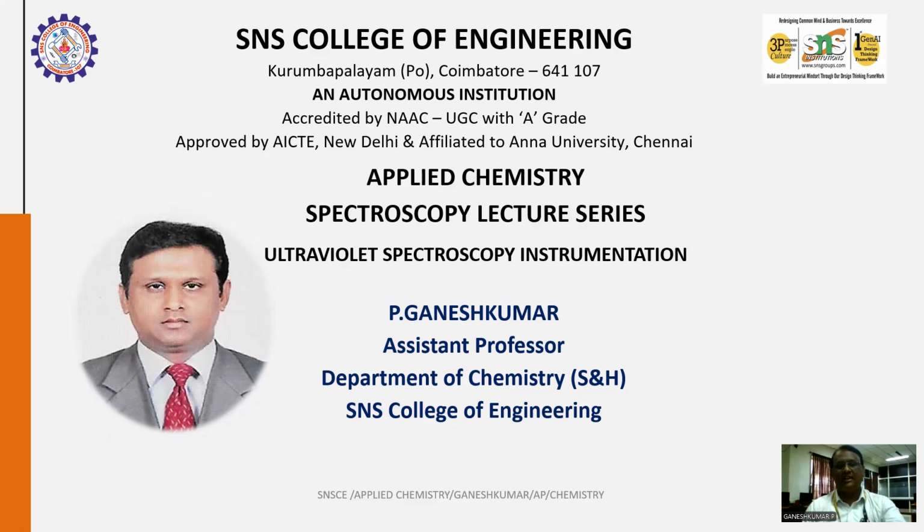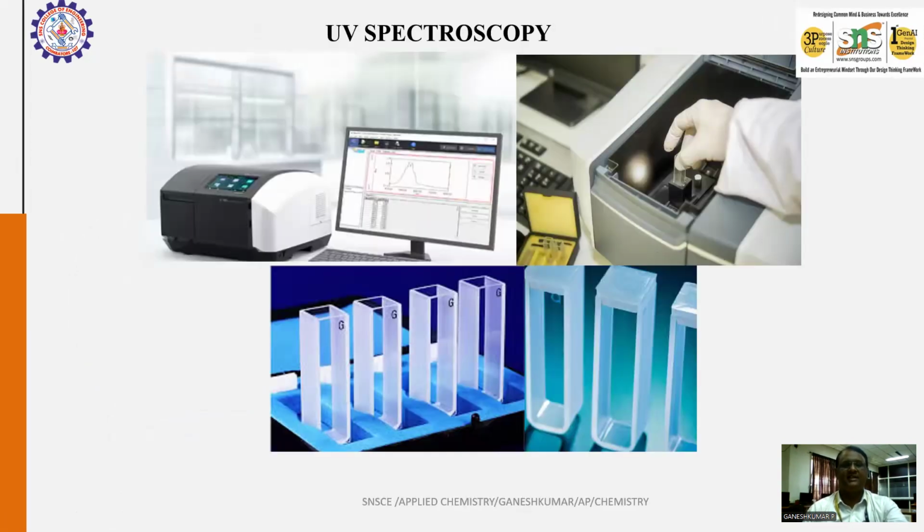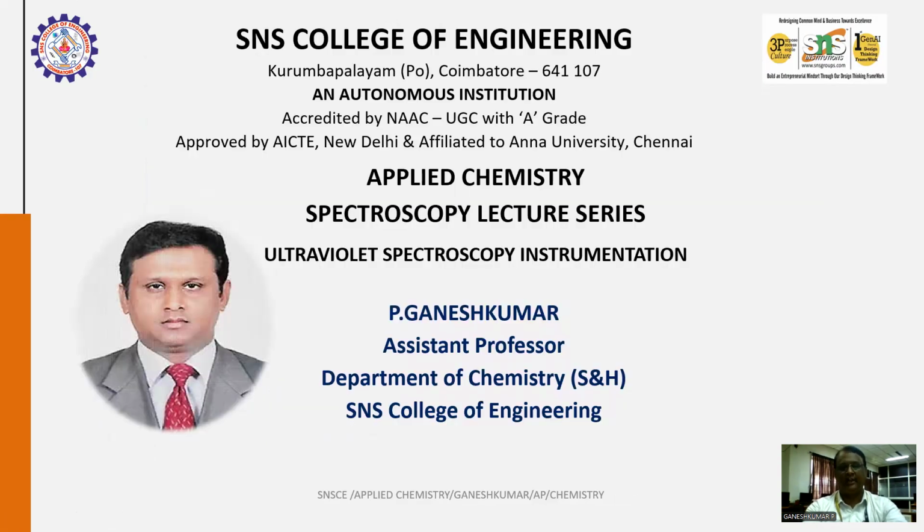Hello all, welcome to this lecture series in applied chemistry. In the previous sessions we discussed electromagnetic radiation, and particularly ultraviolet radiation as an example of electromagnetic radiation. How is this electromagnetic radiation involved in analyzing a sample? Here we discuss the instrumentation techniques, that is, the instrumentation of ultraviolet spectroscopy.